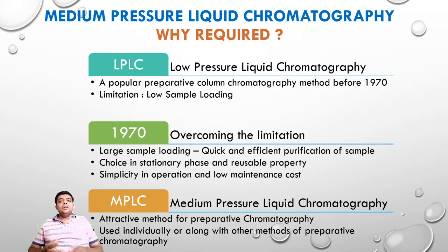Medium pressure liquid chromatography. Why do we require medium pressure liquid chromatography? Earlier, before medium pressure liquid chromatography came into existence, we already had LPLC, that is low pressure liquid chromatography. It was one of the popular preparative column chromatography methods before the 1970s. So friends, over here we will focus along with this MPLC on a particular term, that is preparative column chromatography.